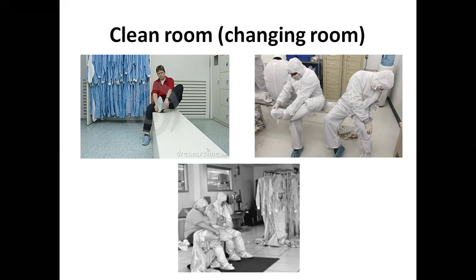The clean room is under surveillance 24 hours. It would be under the surveillance of a clean room in-charge manager. Cameras would be installed inside the clean room, and he would be watching each and every person, and each and every activity through his laptop. The reason? Because the users would be using hazardous or dangerous chemicals and solutions, which would be very, very harmful.